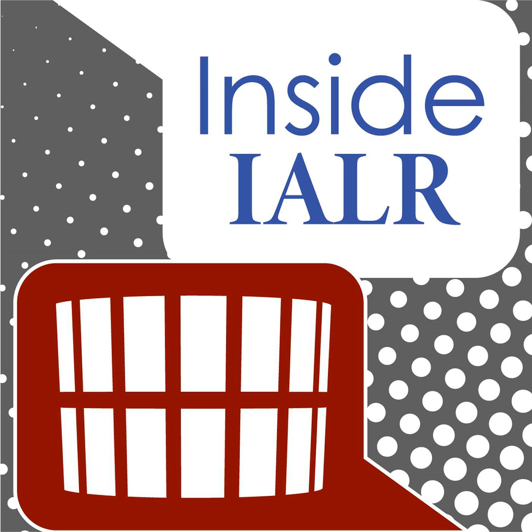But that's all the questions I have. Like I said, I think these things are very cool. Every time I go in one of the labs and look at them and watch the camera roll and look at those time lapses that you all put together, it's a really, really cool piece of technology. But is there anything else that you would want to add or think it's important that people know?